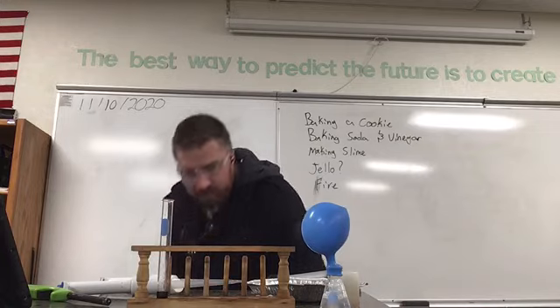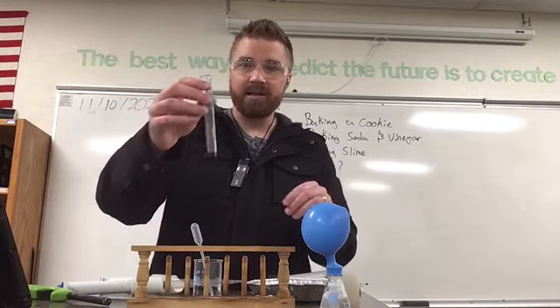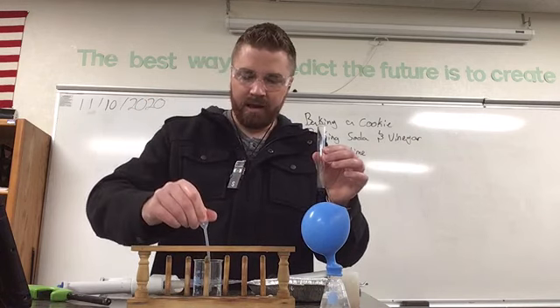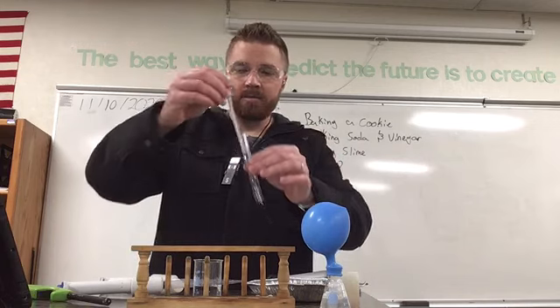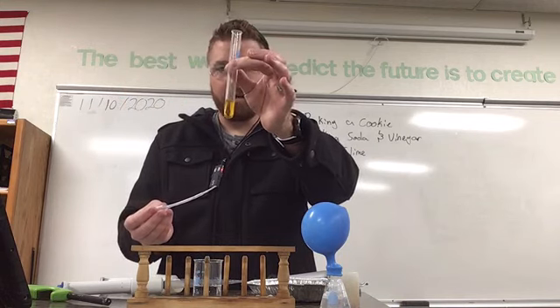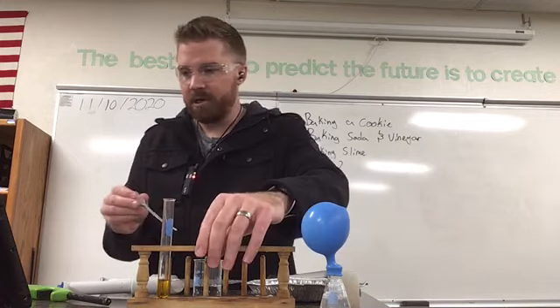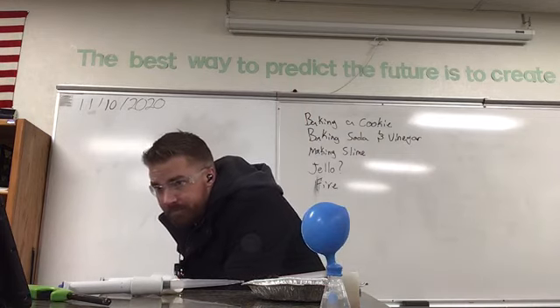This next one is using the chemical bromothymol blue that we looked at with the dry ice experiment. Okay, it's a blue liquid here. And then in this beaker here, I have club soda, which is just carbonated water, right? So I'm going to add some club soda there, and you see that it turns yellow, okay? So we have a change in color that accompanies that experiment there, okay?